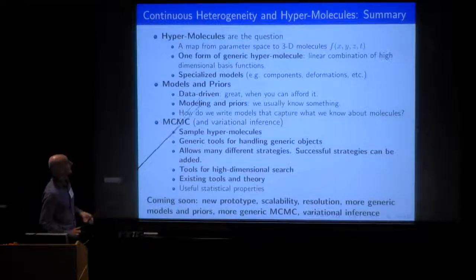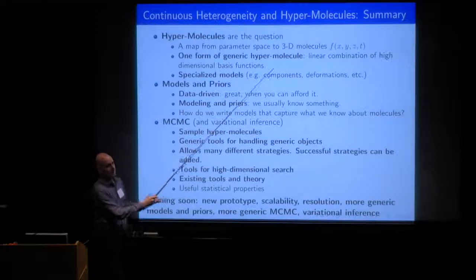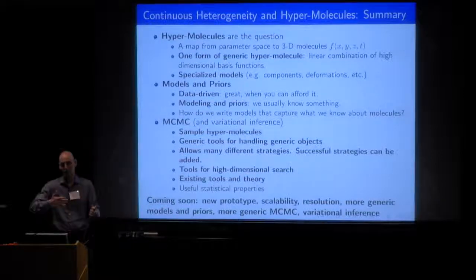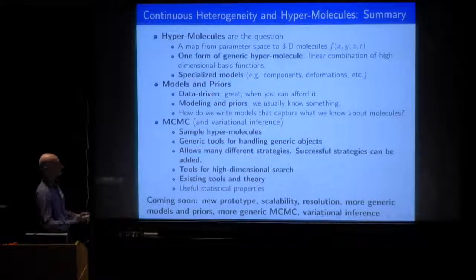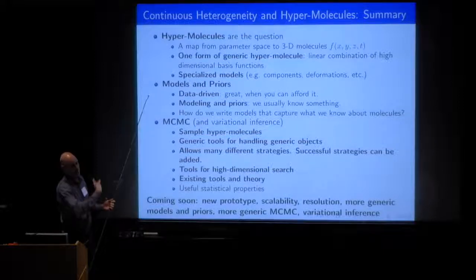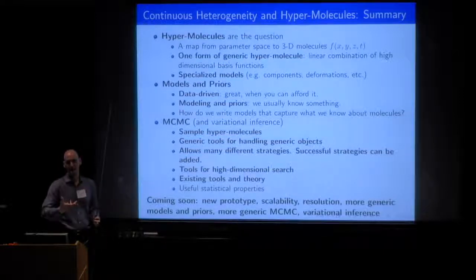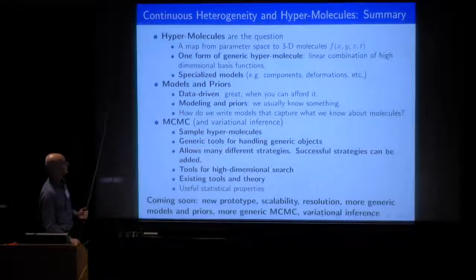So just to summarize, hypermolecules, well, first these are the questions, and hopefully a way of writing the answer. It's just a way of writing higher dimensional functions, and I showed you one way of writing it, which is using linear combinations of basis functions, but it can be anything. You can use them to write more complicated, specialized objects that describe what you know about the problem.